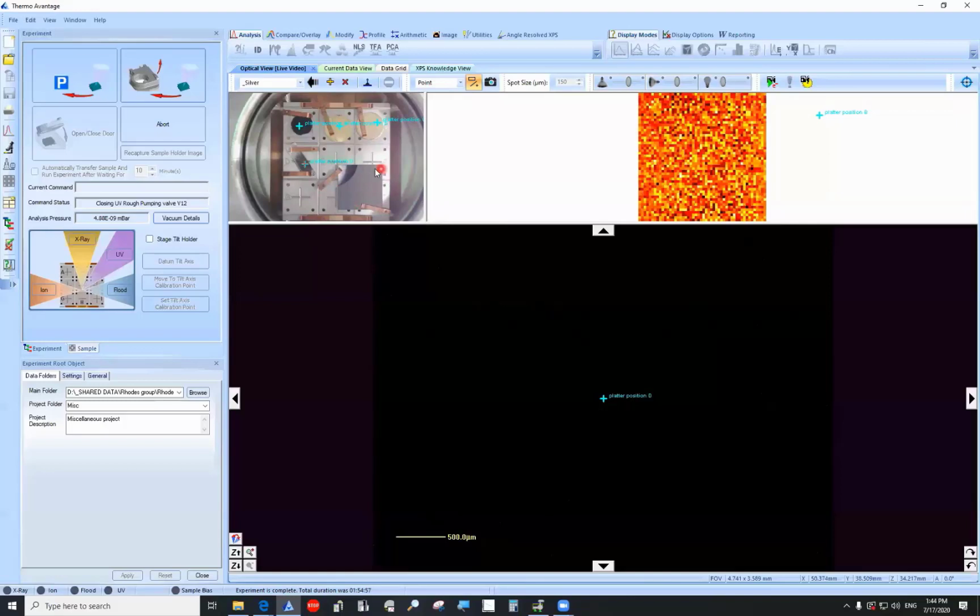All right, so if we want to basically start navigating around our specimen, there are 3 different spaces in here that you need to pay attention to. The first is this picture, which was taken when we loaded the sample into the load lock. This is called the platter view, and it is intelligent in that I can double click on any position within this field of view, and it will drive the stage to that point. Right now, the stage position is indicated by a little red cross, which is hidden behind this data point.